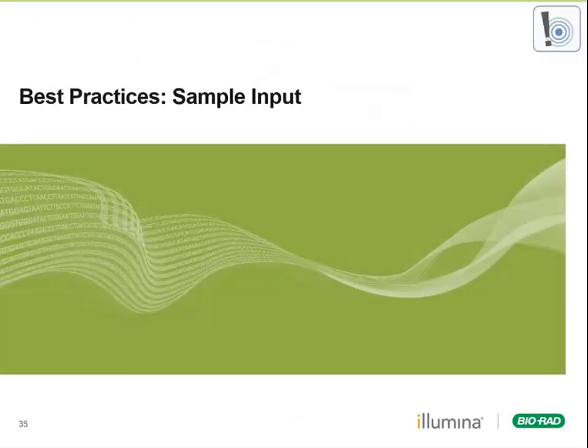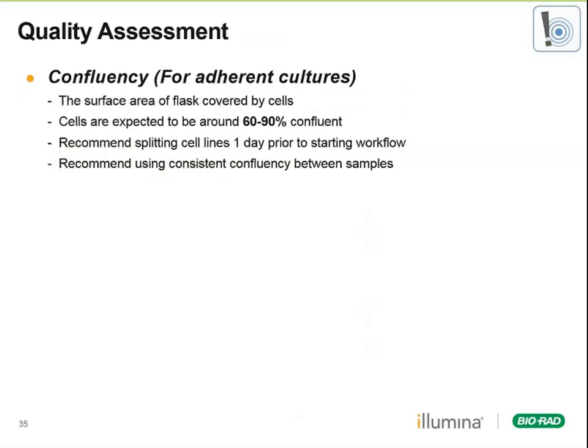A really important area is your sample input. Whatever you put in regarding quality and amount is basically what you're going to get out, so you want to be very careful at these steps.